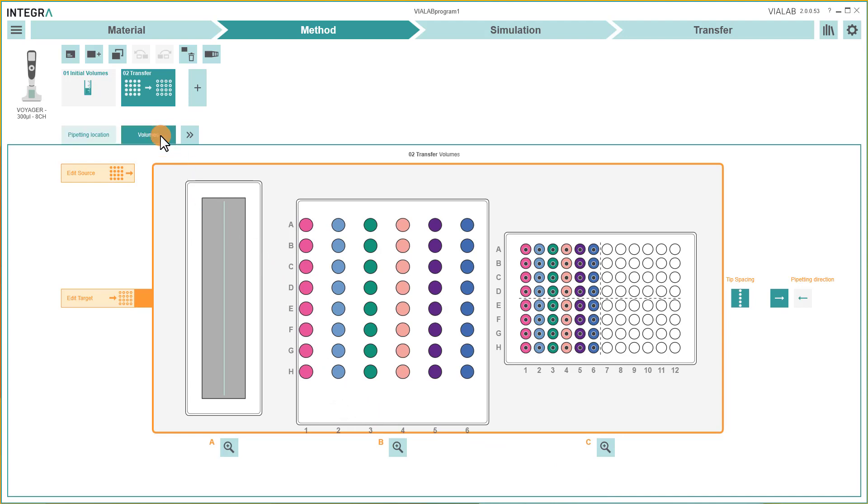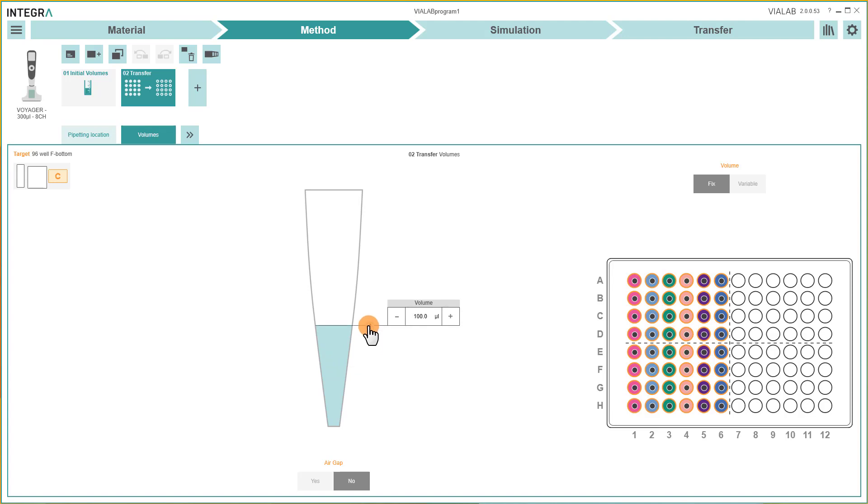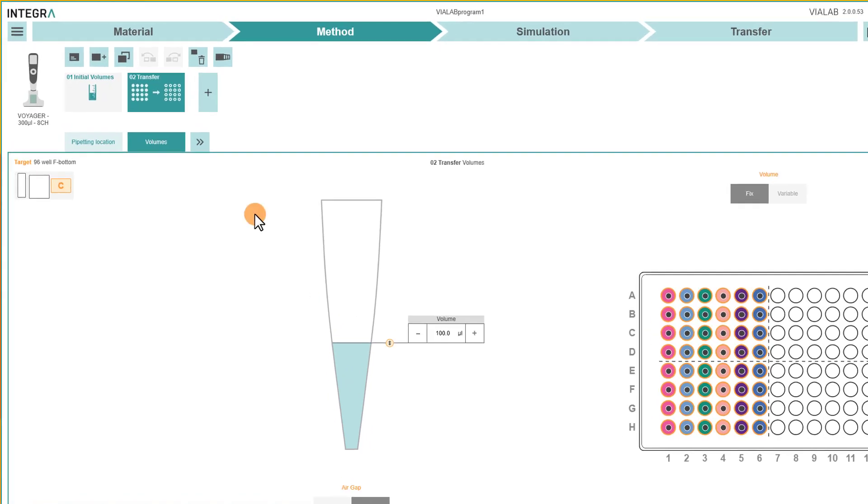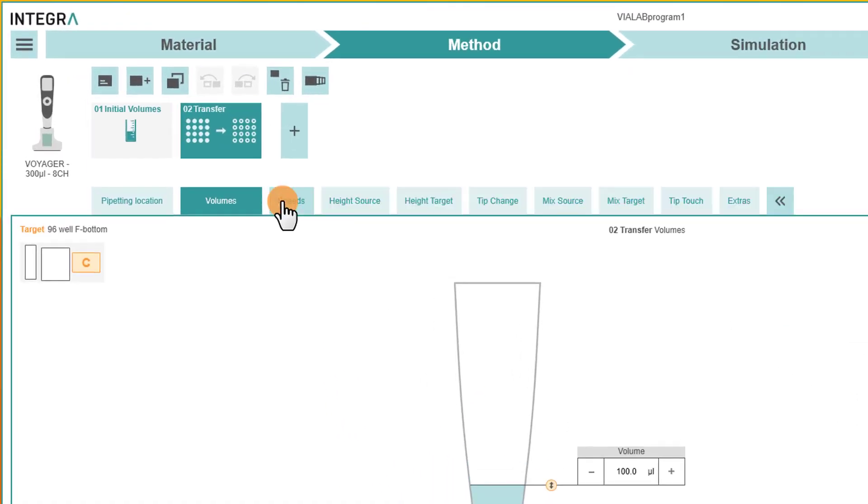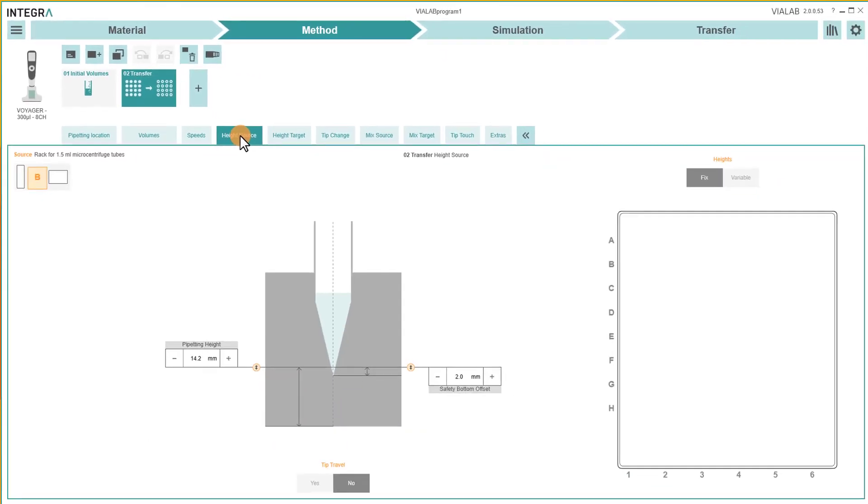To change the pipetting volume, move the slider on the tip to the desired value. If needed, you can change further parameters such as pipetting speeds or pipetting heights.